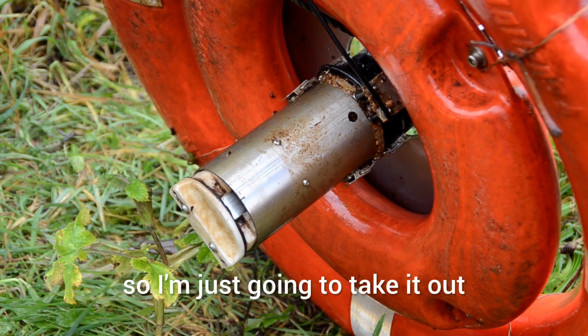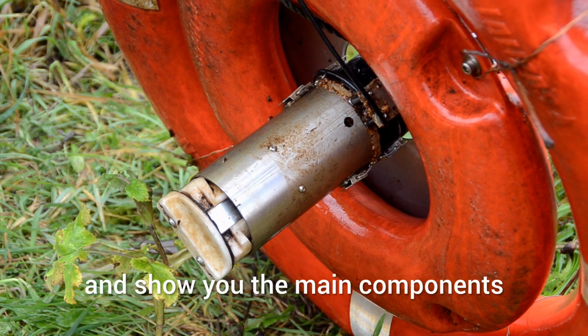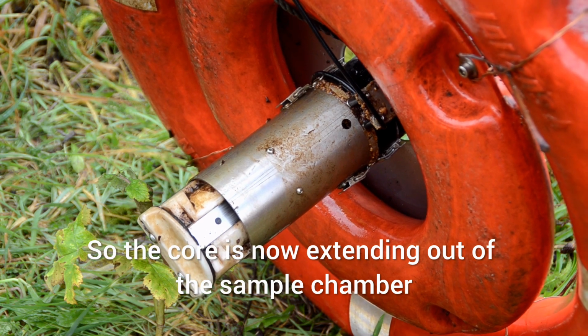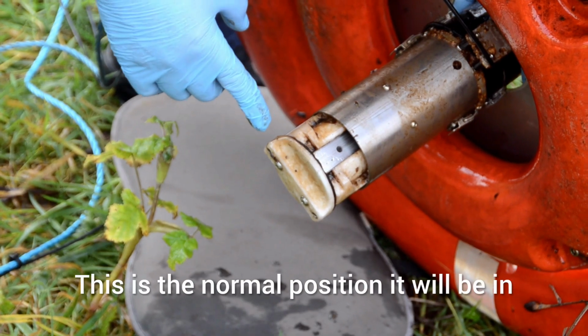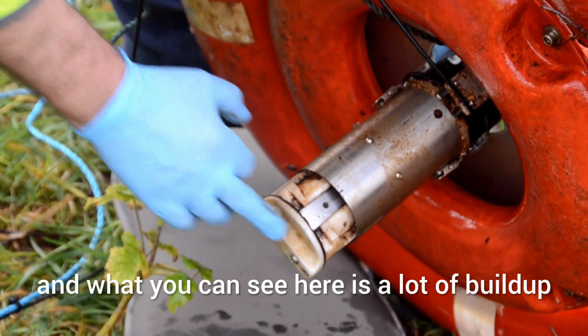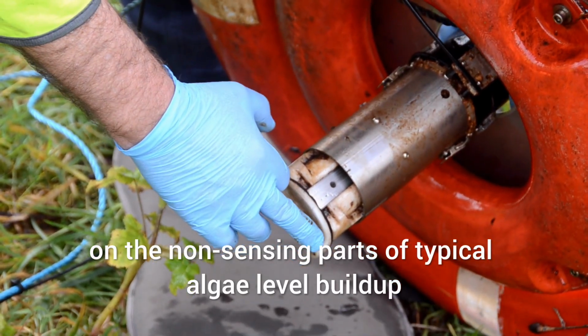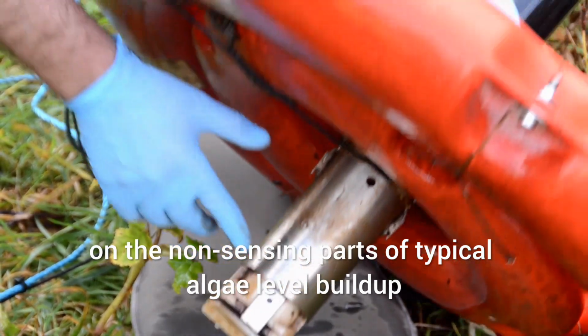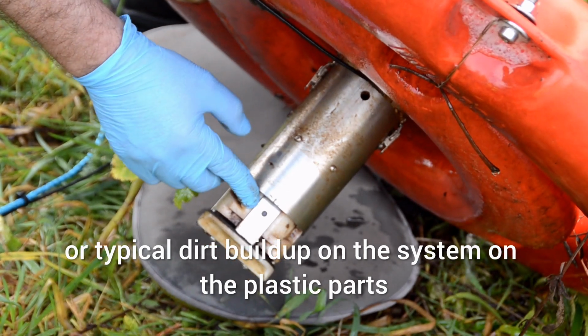But this particular unit has been deployed in this river system for 16 weeks continuously, so I'm just going to take it out and show you the main components and show you how clean they are. So the core is now extending out of the sample chamber. This is the normal position it will be in when it's monitoring the dissolved oxygen, and what you can see here is a lot of build-up on the non-sensing parts, typical algae level build-up or typical dirt build-up on the plastic parts.